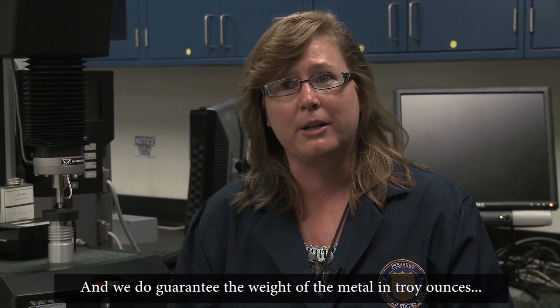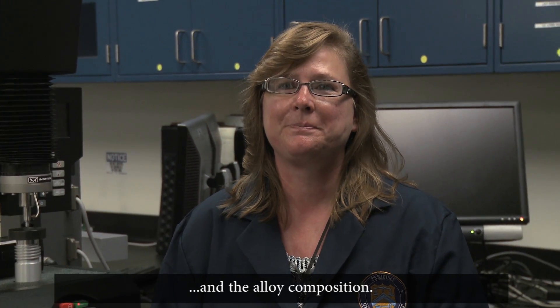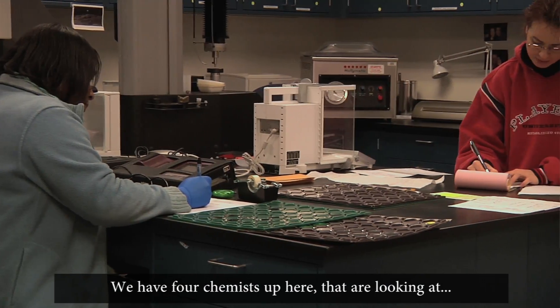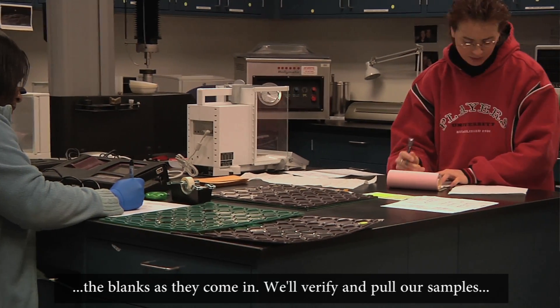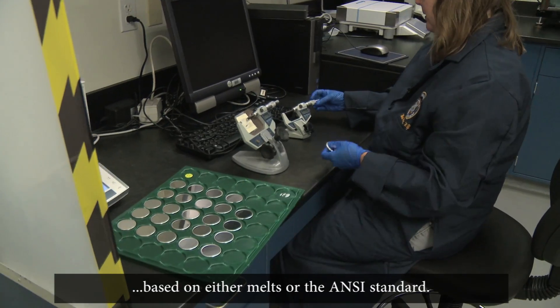We do guarantee the weight of the metal in troy ounces and the alloy composition. The lab has kind of a two-fold function. We have four chemists up here that are looking at the blanks as they come in, and we'll verify and pull our samples based on either MELTS or the ANSI standard.